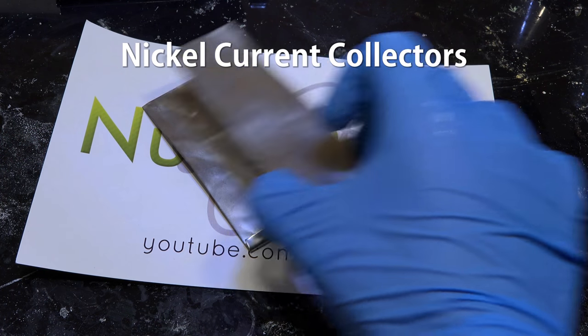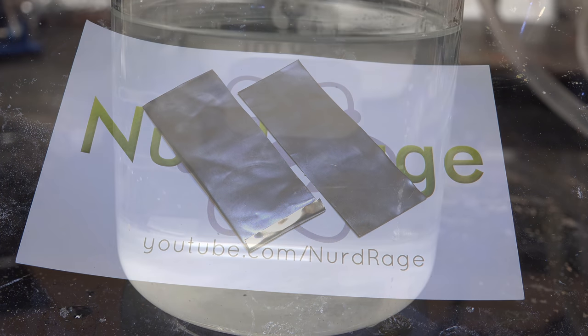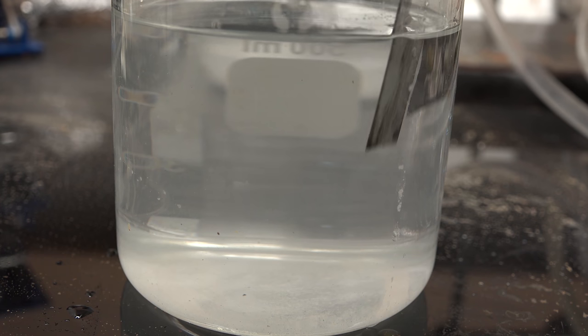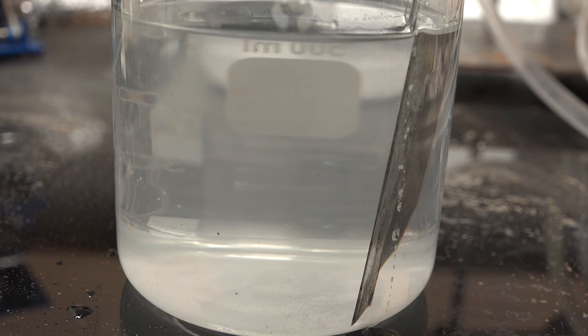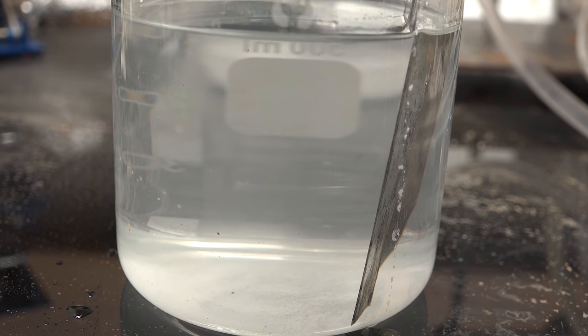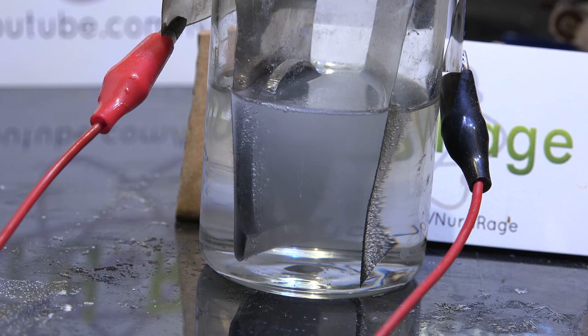Now that we have our electrolyte, let's make our electrodes. First we get a couple of nickel strips. These will be our supporting conductors, also known as current collectors, and I selected them because under alkaline conditions they won't corrode. So I thought they would make very good collectors since they would always maintain a good connection to the silver and the zinc and never break down. Unfortunately I forgot that they have another property which makes them very bad for this experiment. They have low overpotentials. I only realized this when I got around to charging the battery, which you'll see in a few minutes.